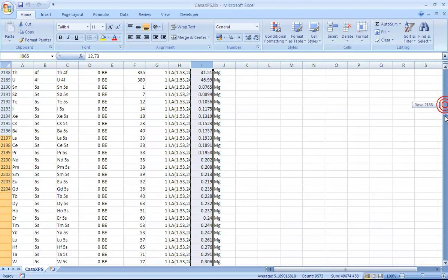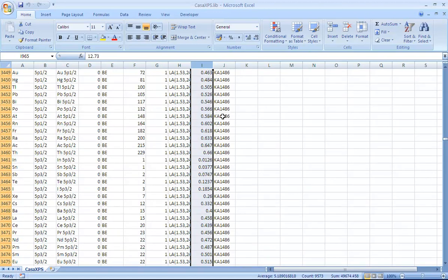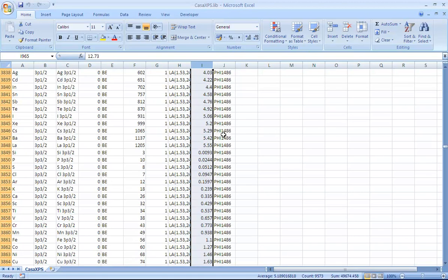There is another alternative where a specific instrument is indicated by a source label that is different from aluminum and different from magnesium. This is an example of a K-alpha entry. We also have an entry for a PHI instrument. PHI instruments typically use an aluminum anode, so these are labeled PHI 1486, relating to the photon energy. This indicates that these RSFs can be tabulated as distinct from the aluminum magnesium Schofield library. These will be offered for any data for which the VAMAS field within the VAMAS file for the spectrum states PHI 1486 as opposed to aluminum.